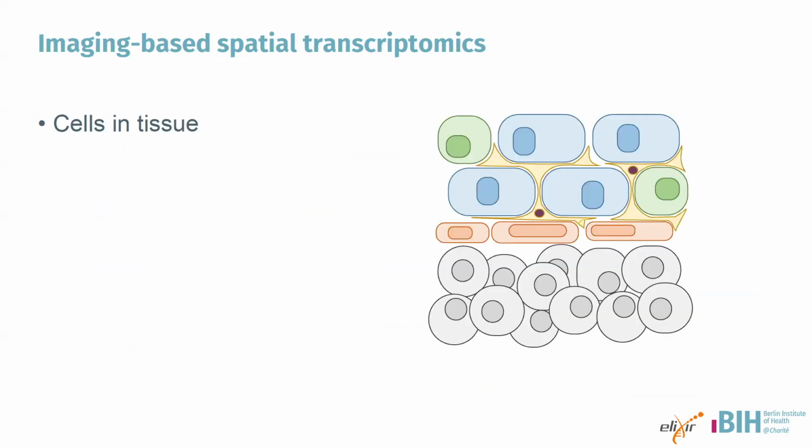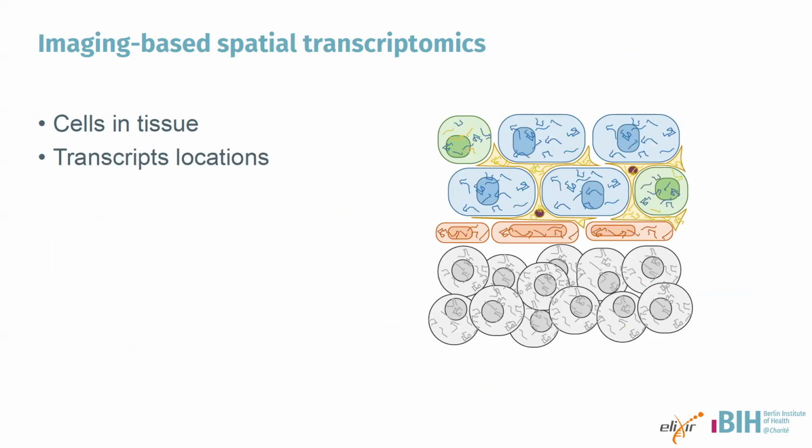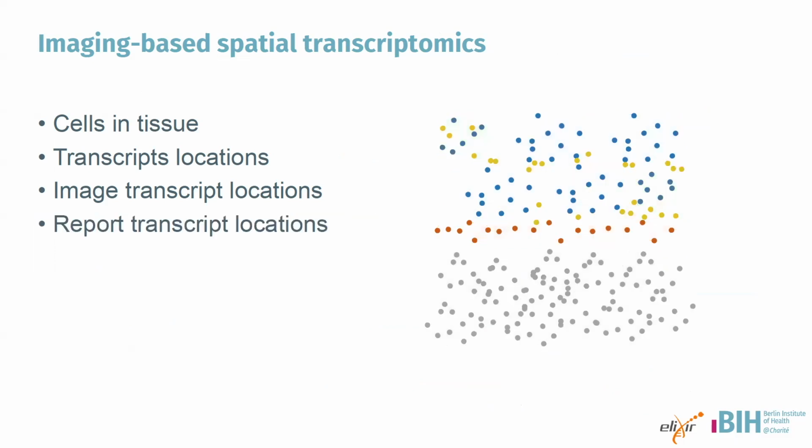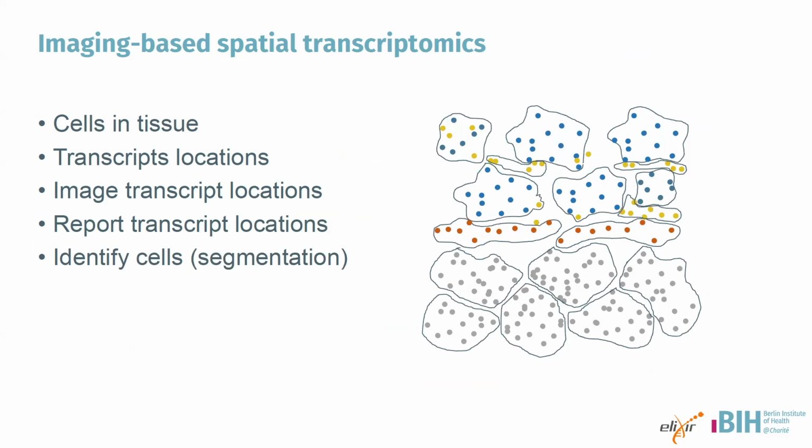And the most common way of doing this is essentially going through this procedure where you have your cells. Those cells will have transcripts, and through your imaging-based method, you will localize those transcript locations in your cells. But when you get your data, you don't see the cells, you see the transcripts. And then you use a computational method to figure out spatial patterns, or you use a counterstain to overlay onto your data. Here, I've used a very simple method of guessing which cell belongs to which transcript based on my best judgment. And you can roughly see some cellular architecture of tissue, which looks pretty reasonable when you compare this to the original tissue.